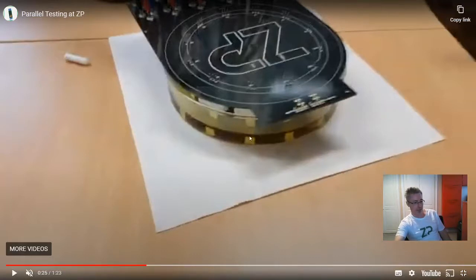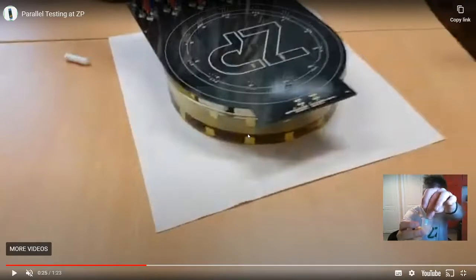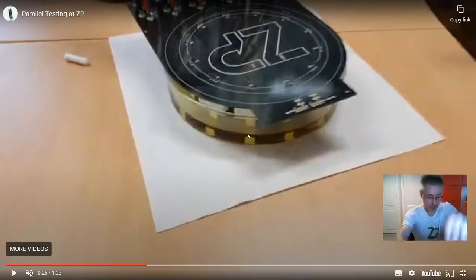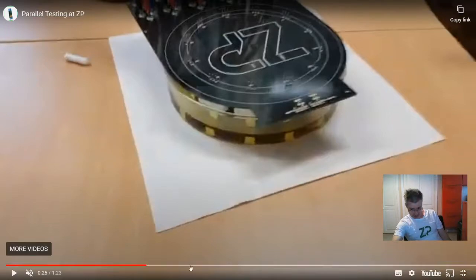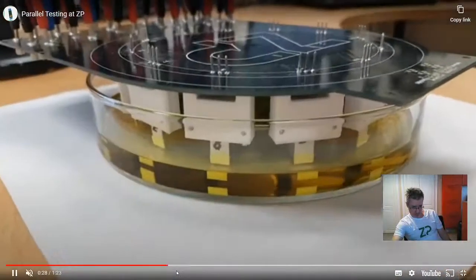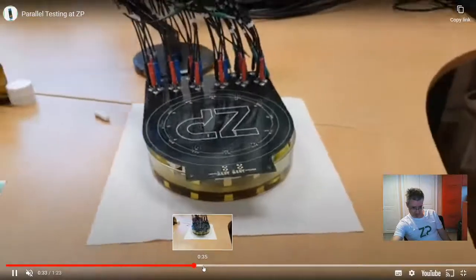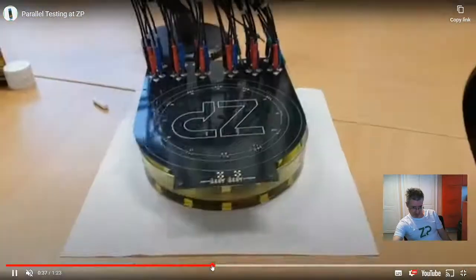You could imagine having a circle of 12 pots where the electrodes come down into those individual solutions. That's how you could then test different solutions. You can see them all in solution there.